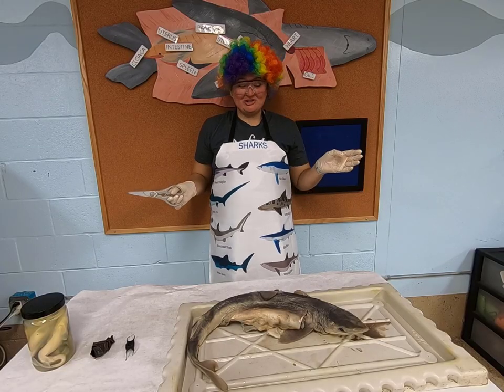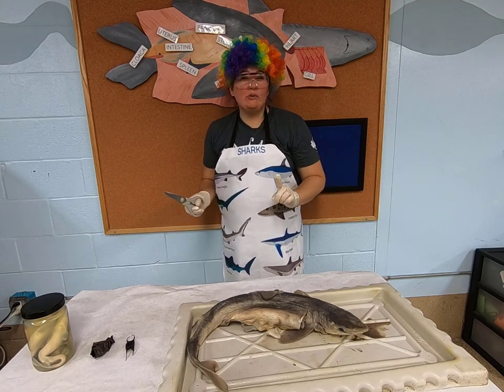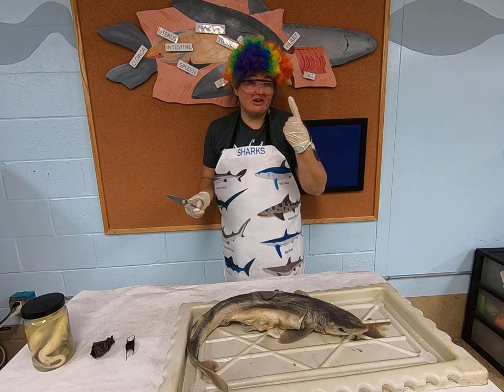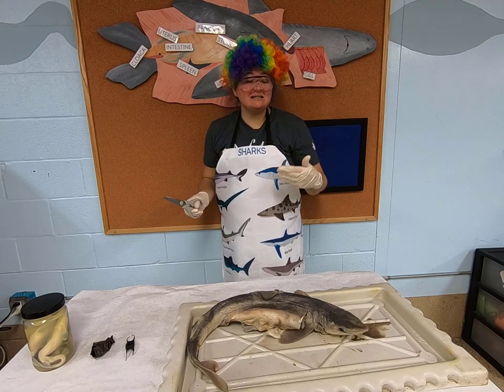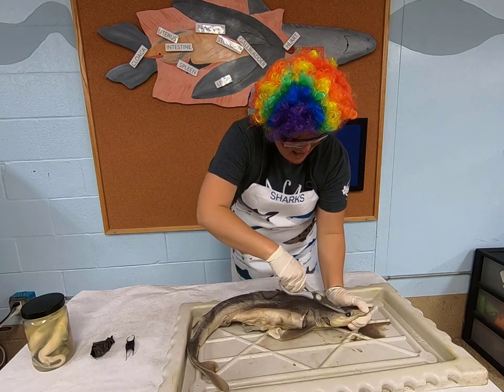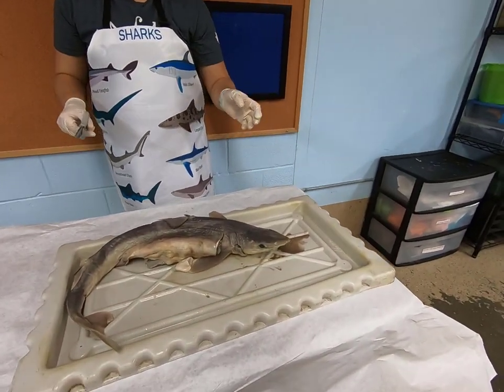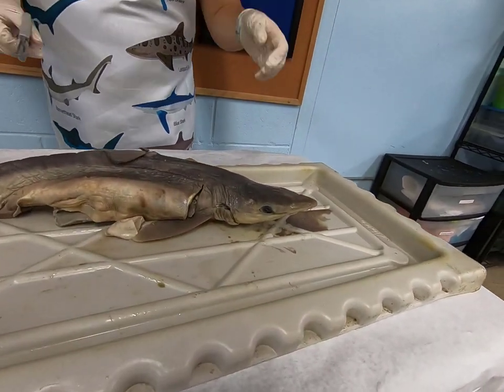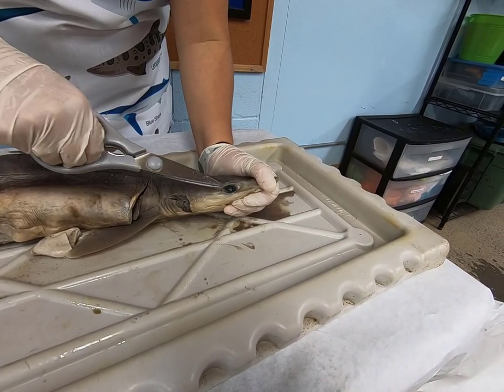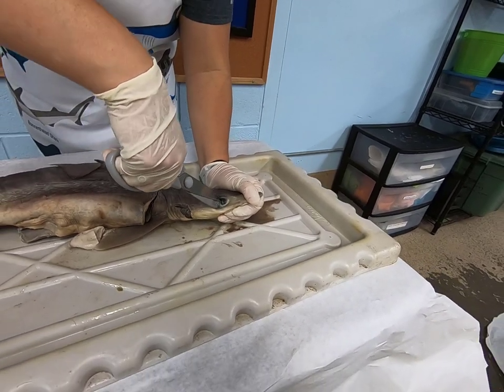I think we should dissect the eye. So this is a splash zone, so be wary. This is really the reason why we wear our safety goggles and protect our clothing, because it is a splash zone. Sharks do have this gel inside of their eye, and it does squirt out at you. Now, just a reminder, we're looking for the lens of the shark's eye, and the lens is actually going to be a big circle. So let's go ahead and try and see if we can get a good squirt.